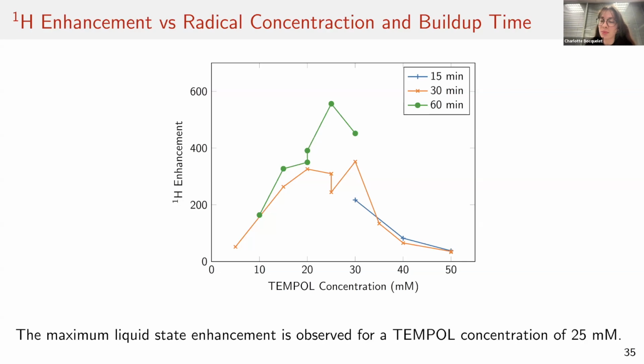So about this collaboration with Alvarta on drug screening, what's your strategy then to measure the bindings? You want to use a single scan CPMG or measure a T1 decay? What's your strategy? Yeah, so there are actually various so-called contrast mechanisms for the binding. So a CPMG type is possible, and that's high up in our books. There is also a T1 evolution that actually has an interesting field dependence. So that's also something we are looking into. Yeah, and then we see what else comes up.